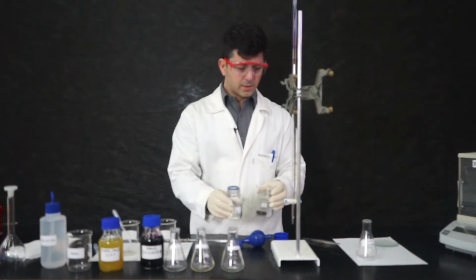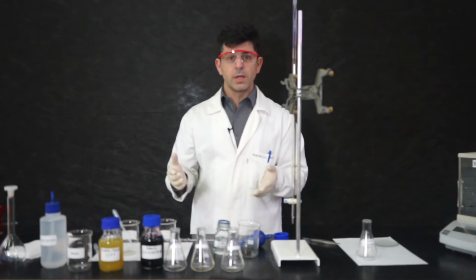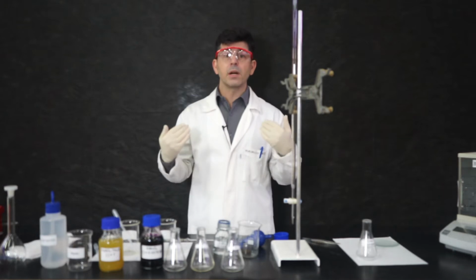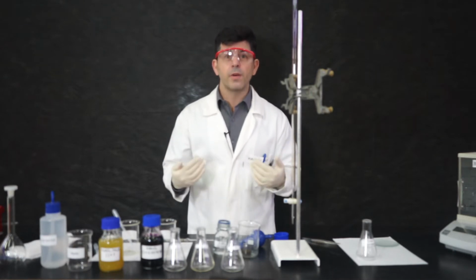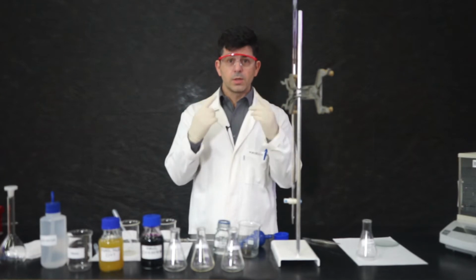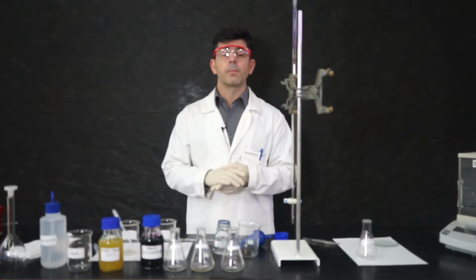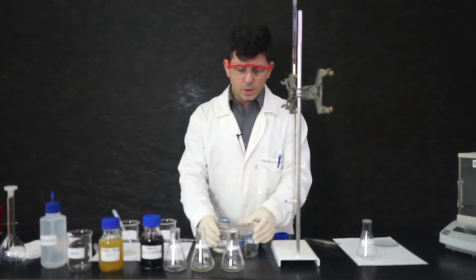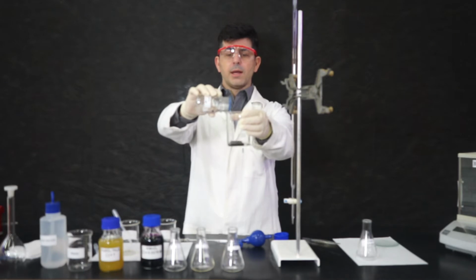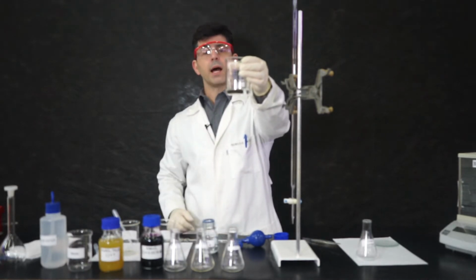Before I do this, working with acids is always something dangerous. So whenever you go to a lab, you need to be wearing a lab coat made of cotton, which doesn't catch on fire very easily. You should wear gloves and goggles. Never go to a lab without all the safety materials you need. Okay? So when we add sulfuric acid, you will see this will slowly react.